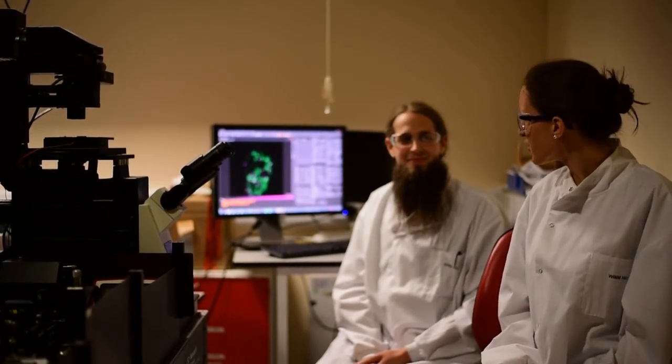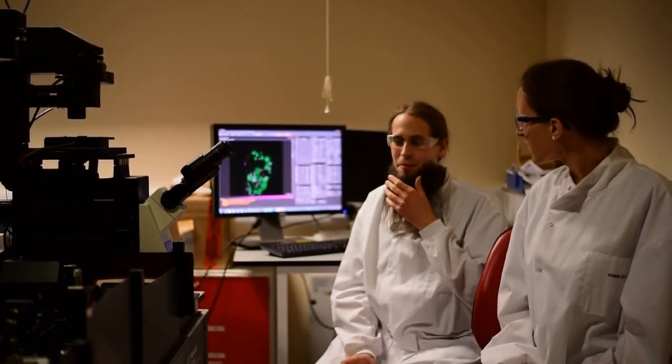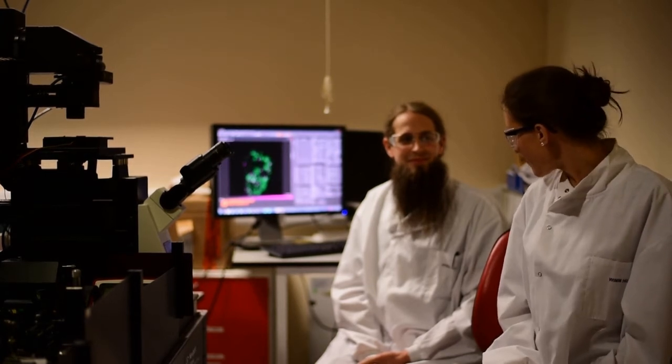So how many proteins can you do at the same time? So at this microscope we can do up to three and others we can do four or five. Four or five, okay. Well I wonder how many the flow cytometers can do. Let's go downstairs and check. Thank you Falk for your time. You're very welcome.